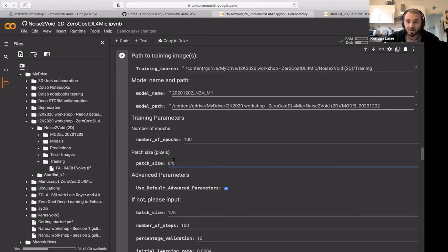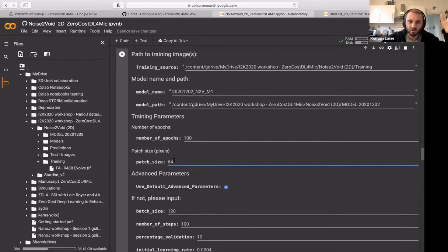That has an influence in terms of how it trains, of course, but it also has a major influence in how the memory is handled on the GPU. In this particular notebook, small patch sizes of 64 are great because, as I was saying earlier, you've got a 64 by 64 patch. It'll remove a certain fraction of pixels, and then try to predict those pixels, and do this over and over again without having an enormous context of a large patch.